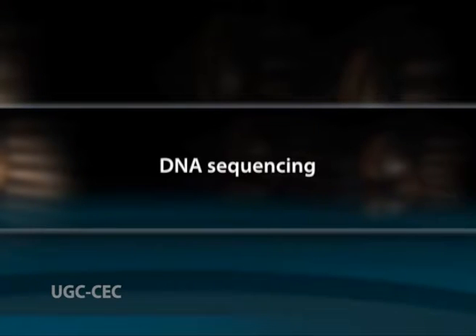DNA sequencing. DNA is the information stored that ultimately dictates the structure of every gene product, delineates every part of the organism. The order of the bases along DNA contains the complete set of instructions that make up the genetic inheritance. Sequencing is a key technique in genomics.